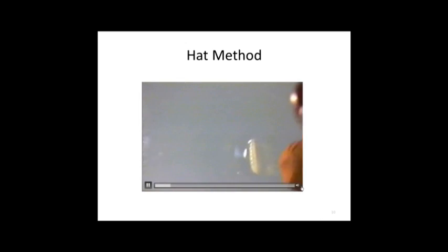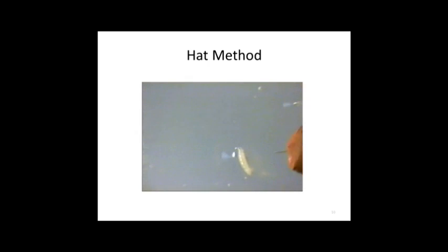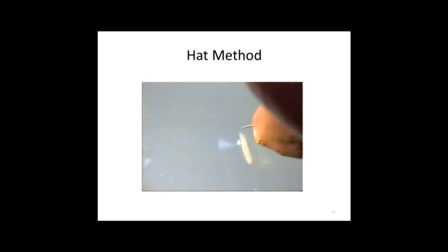Here you can see the insect pin touching the tail, and then I'm waiting for the larva to continue crawling. Then touching the abdomen, and you can see it's pretty obvious then that the larva paused any kind of locomotion. So waiting again, and then stimulating the head. So there are different kinds of responses that I could see from each different type of touch on any of the 3 areas that I touched.